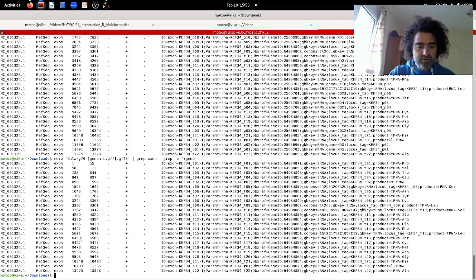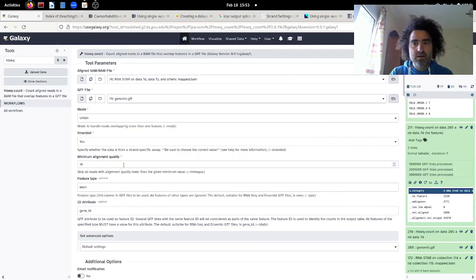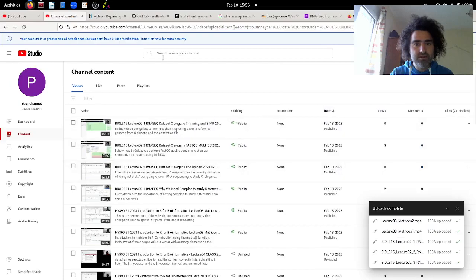For that I downloaded another file from NCBI. Let me find it to demonstrate it. It's not here. Yeah, it's here. Okay.